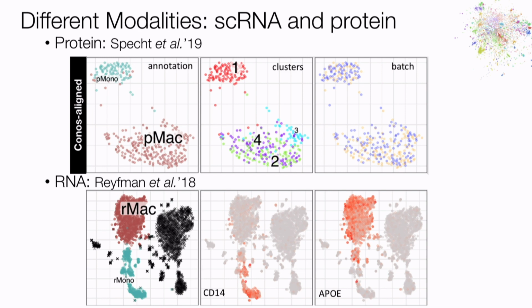But like I said, the RNA signal is quite robust, so whether we use them or not probably won't make any difference. In fact, we often do this exercise where we determine the top differentially expressed genes, let's say for these two clusters, let's say 100 genes, and remove them and reanalyze. And two clusters pop up again, and we remove them again. So you can keep doing this surprisingly a lot, because the expression manifold that we're looking at is very simple, right? And so many genes support it. So I think picking on individual genes doesn't help in this case.